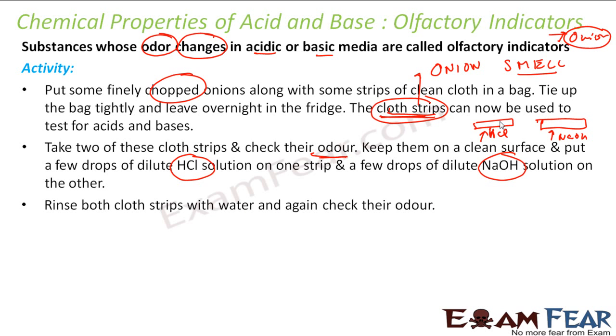You'll observe that the smell of this strip with HCl is still there.